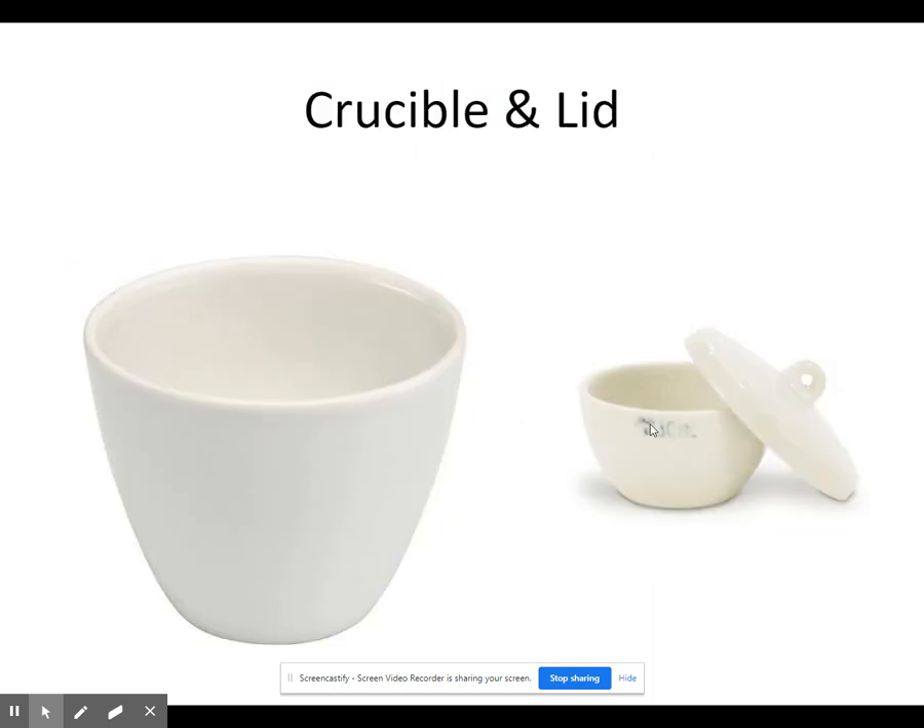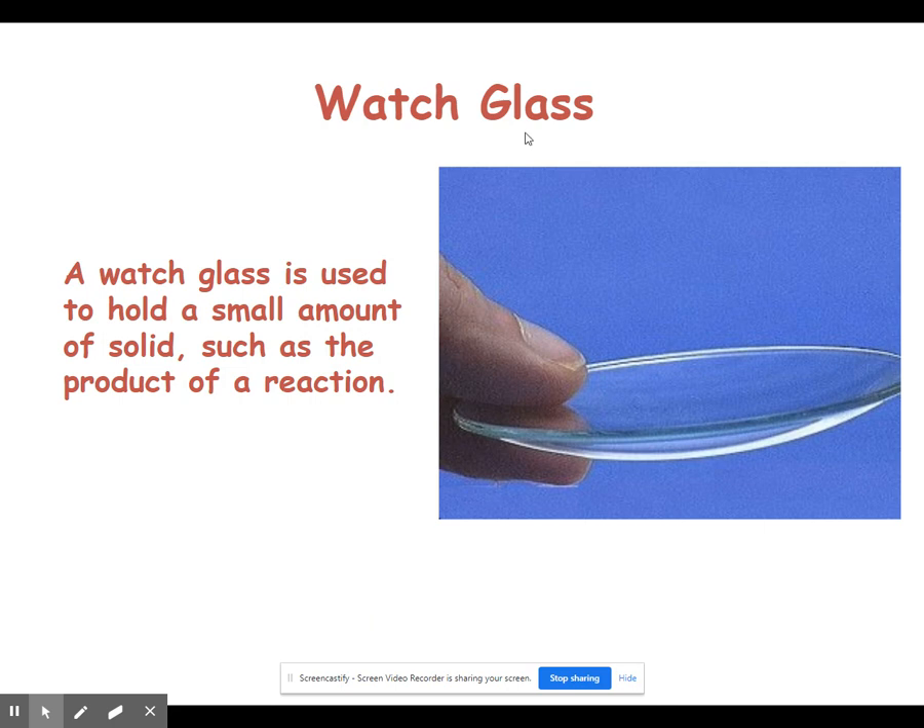Crucibles typically come with a little lid. The next piece of equipment is a watch glass — just a small piece of glass with a slight curve to it. It has a lot of uses: we can place a small amount of solid on it to take a closer look, and it can be used to store products. It has many varied uses in the lab but no single major specific use. Typically anything you'd use a watch glass for, you could use something else for as well.